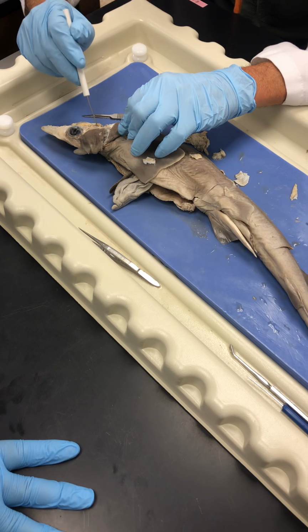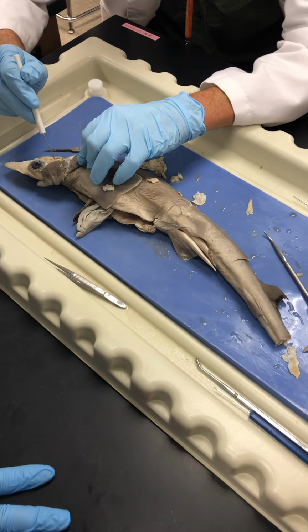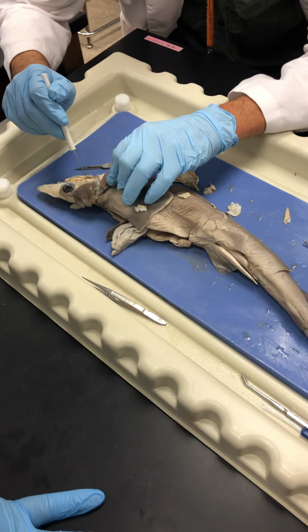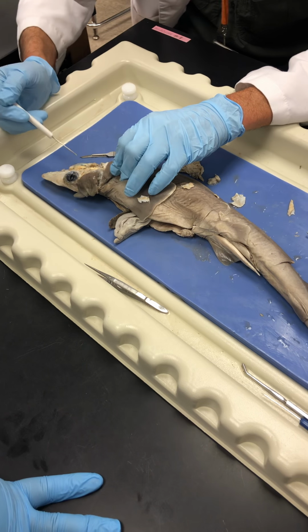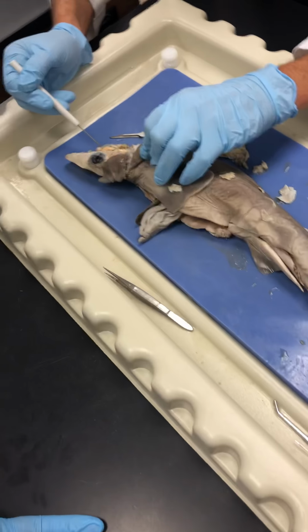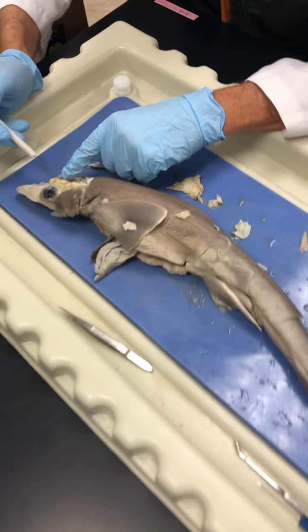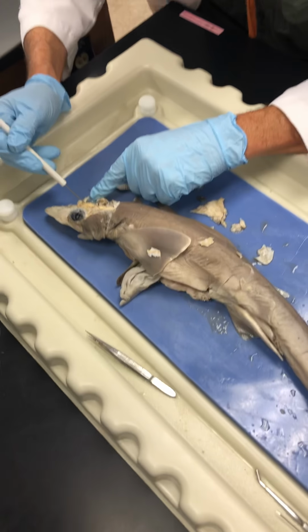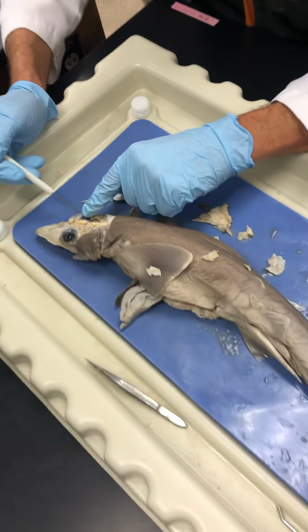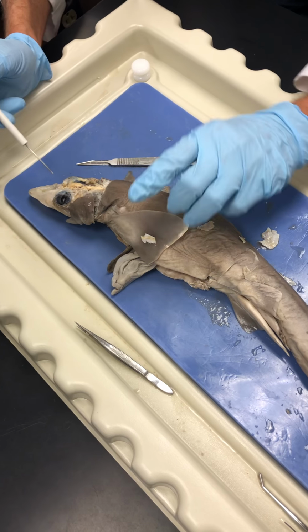Now coming off right in this area, right in here, and I want to say that's it, but it's awful masticated. We would see a nerve coming off right here called the vagus nerve, and that's the largest nerve that comes off of the shark. Okay, here's the eye. You have muscles on the sides that help move it, and then this back part right in here, which we kind of messed up. We have an optic nerve. Now, you need to slice the eye open and take out the lens and take a look at the lens.